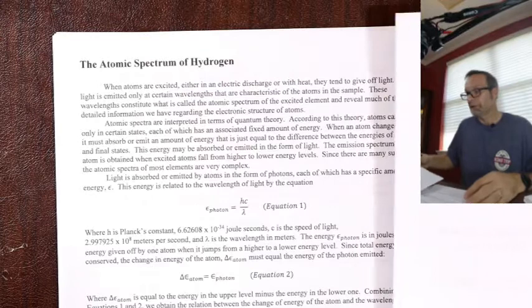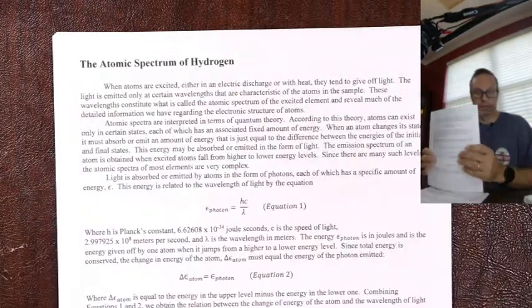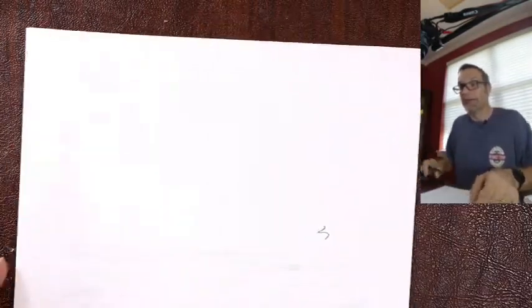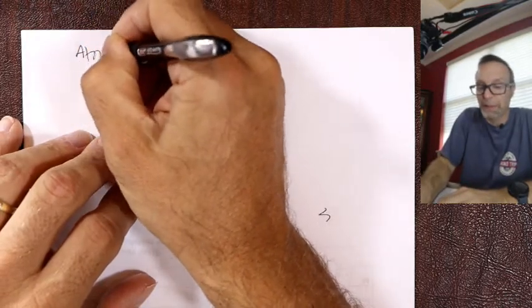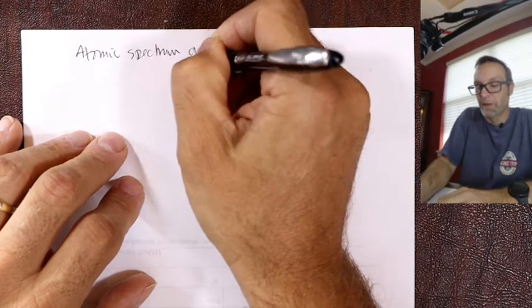Now, what I'm going to do is run through my prelab that I do in class, okay? So it makes for a nice common sense introduction to this, all right? So obviously we're going to look at the atomic spectrum of hydrogen.